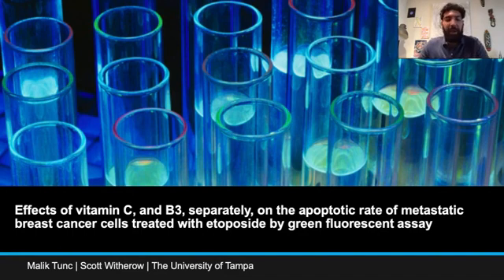Today in this video, I'm going to present the research I did on the effects of vitamin C and B3 on the apoptotic rate of metastatic breast cancer cells treated with etoposide by green fluorescent assay.